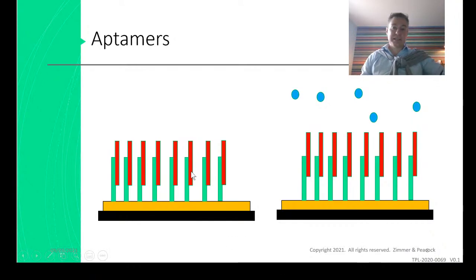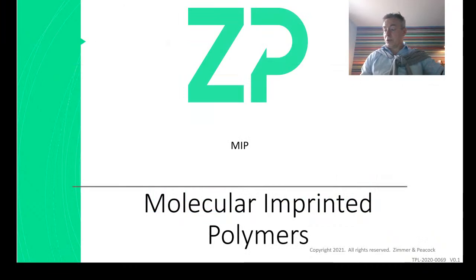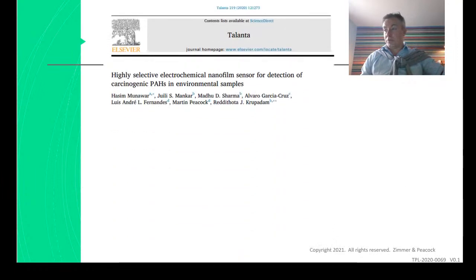Otherwise, Ali's right, and it's just hard work in the lab, which we apologise. We did get a nice inquiry this week about MIPs. So somebody asked us to recommend some electrodes for MIPs. This is an easy one for us.